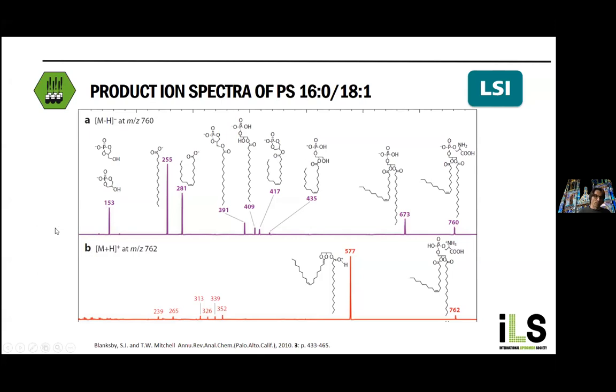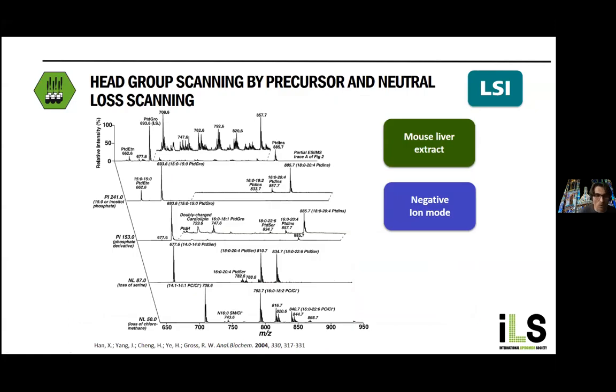So at the end you could use both positive and negative ion mode and really come to a justified, proven annotation of your lipid, of your m/z feature you observe maybe in an MS mode. But frequently it's also not so easy, because if you use direct infusion, you have quite a crowded spectrum. We heard it also in the previous talks. There are a lot of different lipids present at the same mass-to-charge ratio.